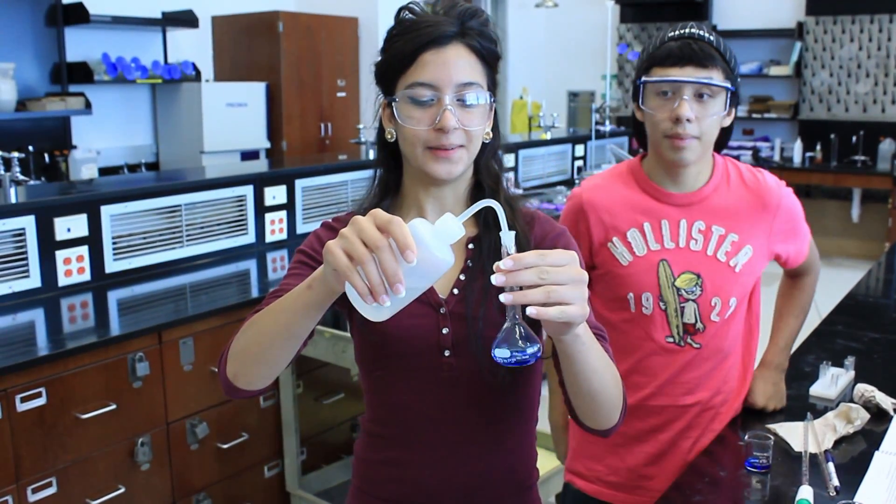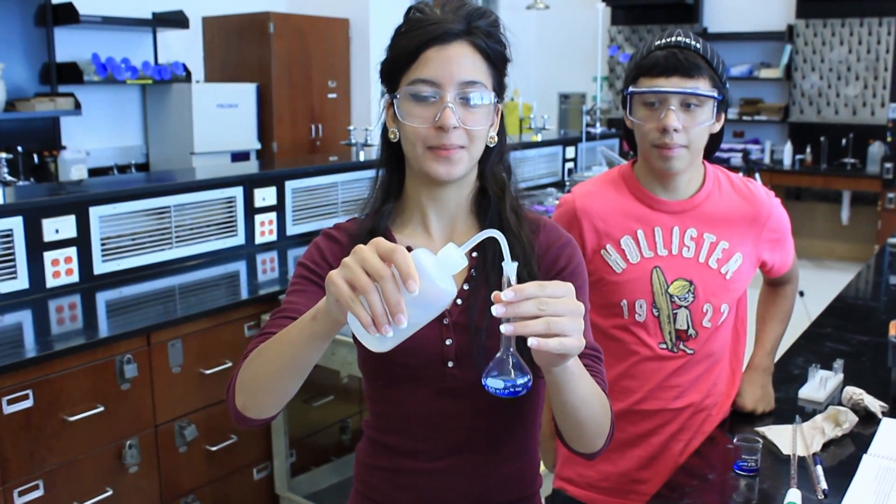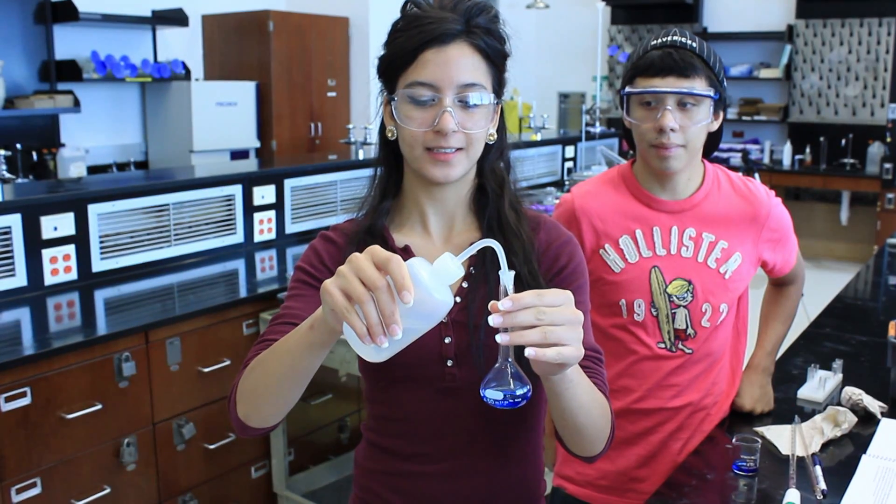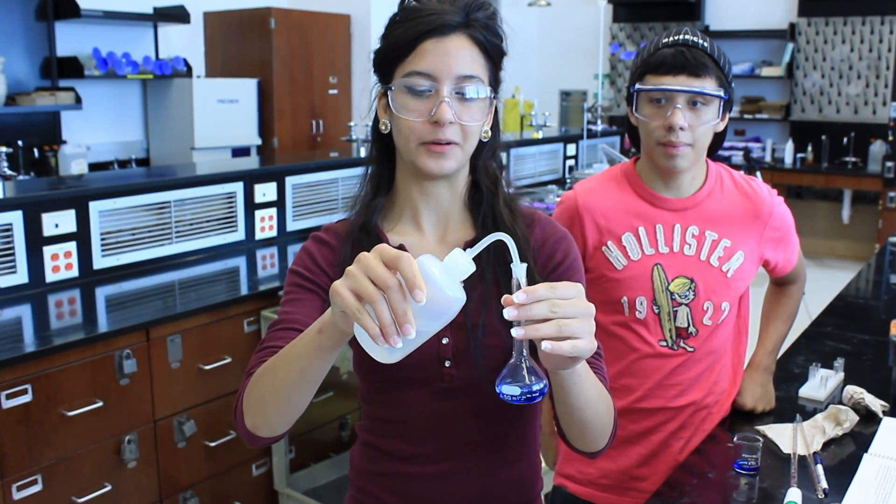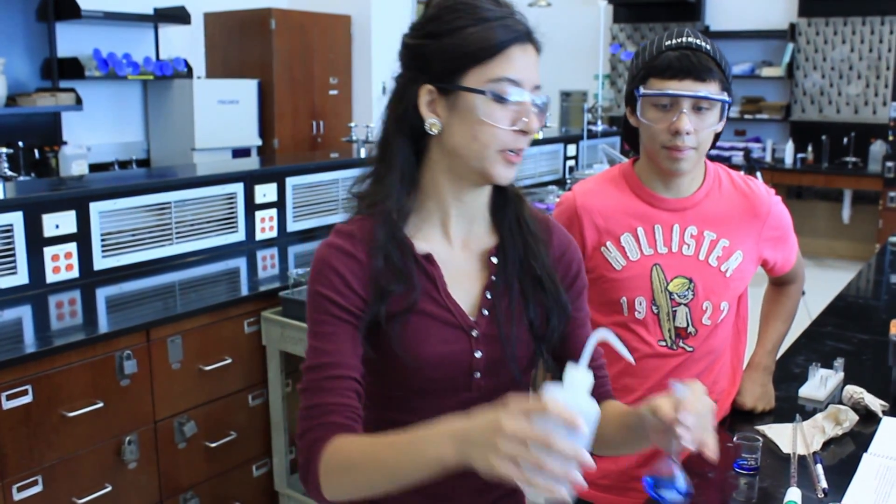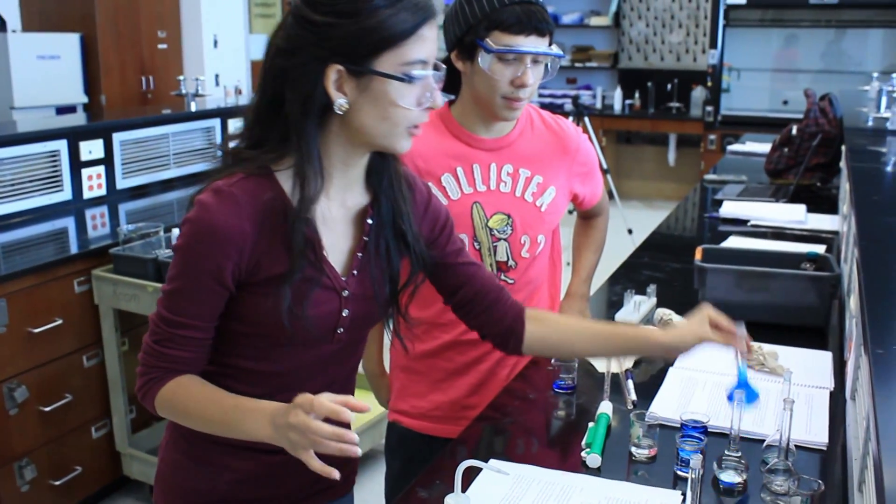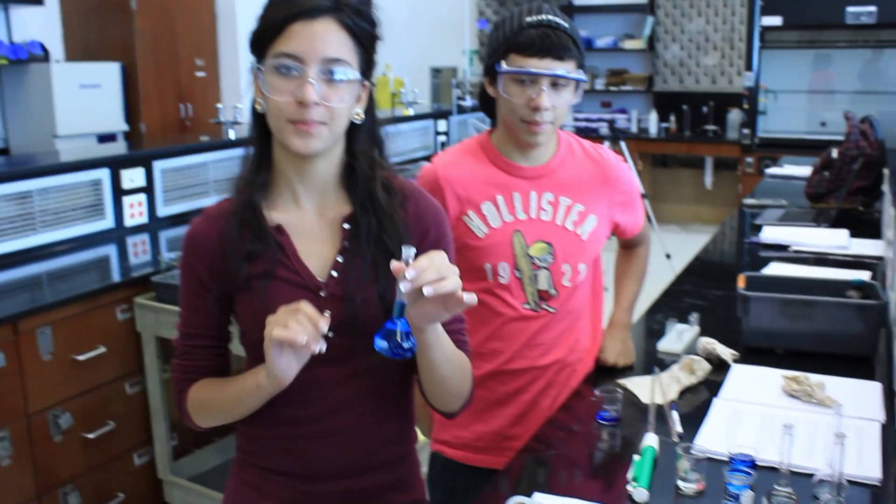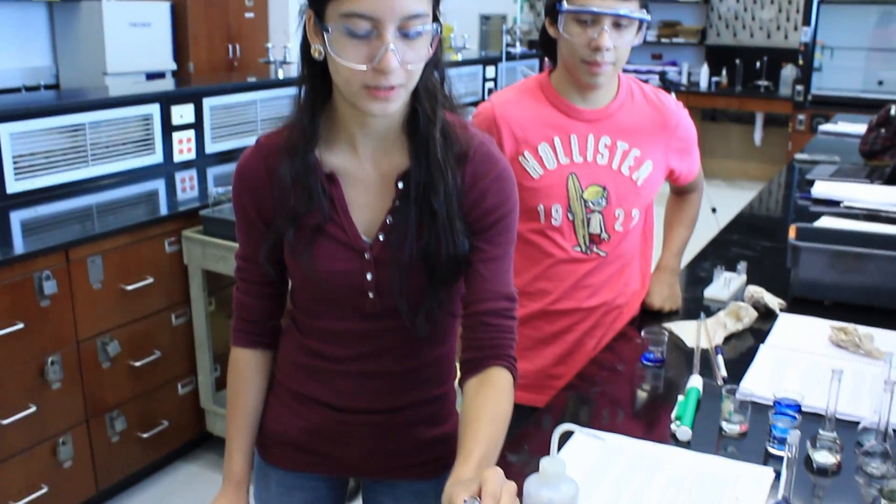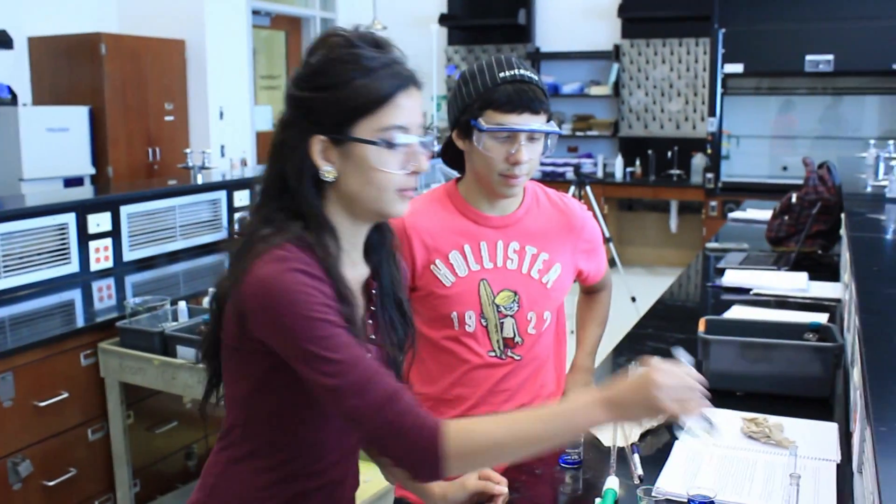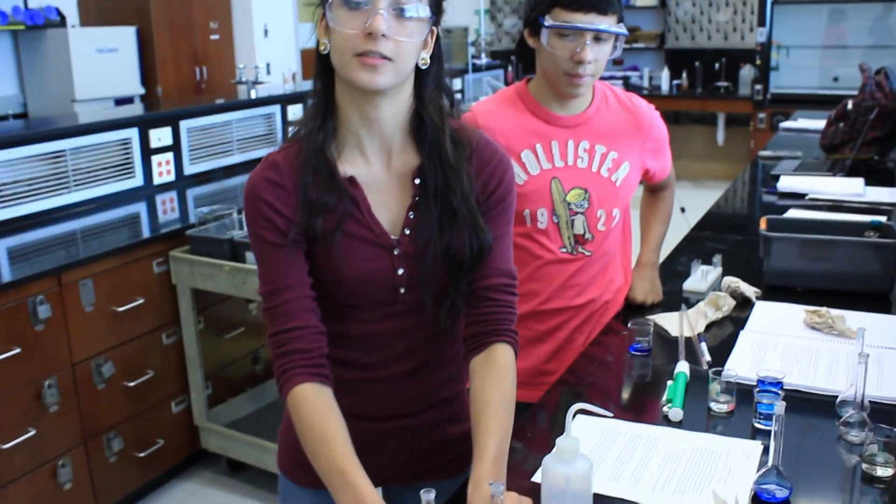Then you dilute this in your volumetric flask to the 50 milliliter mark. When you're finished it will look like this and you do the same thing we just did with 2 milliliters of your bleach solution and you'll end up with 2 working solutions.